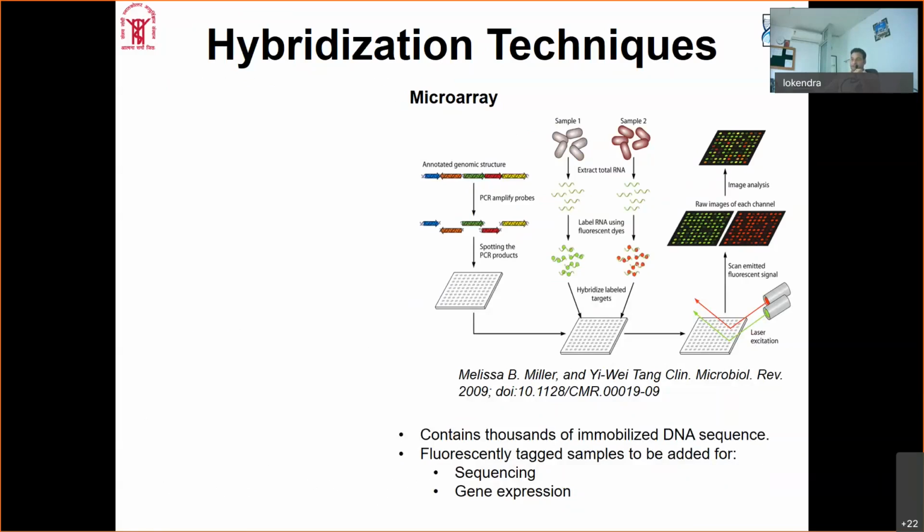In this case, the probes are designed and pre-coated on certain plates, having multiple very fine spots in the micrometer range, and these products or PCR products are adhered, or you can say attached, to the surface. These probes are already known, including how many copies of them are attached.